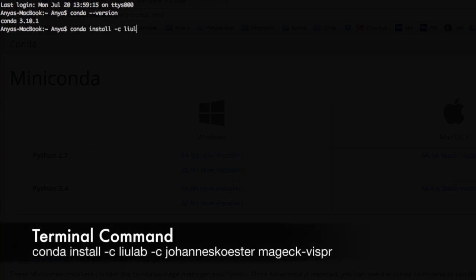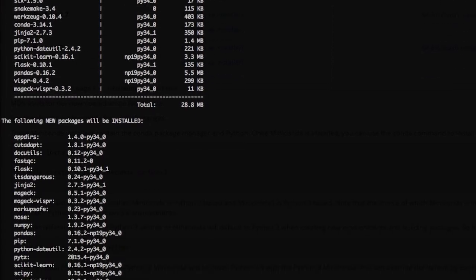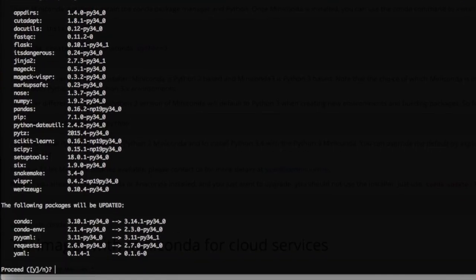To install the workflow, enter conda install -c liulab -c johanneskoester mageck-vispr. You can copy and paste this from the video description below.